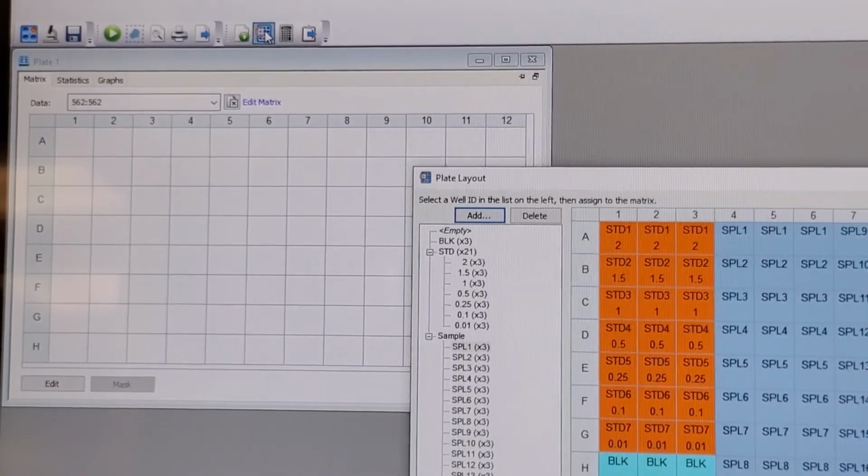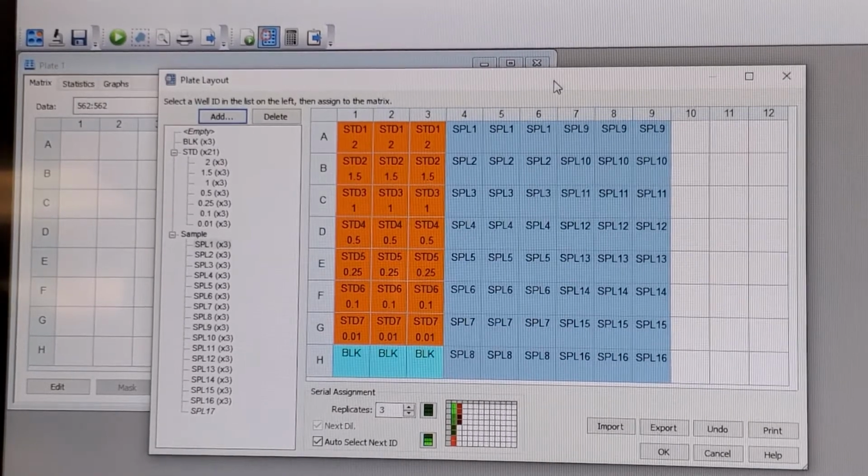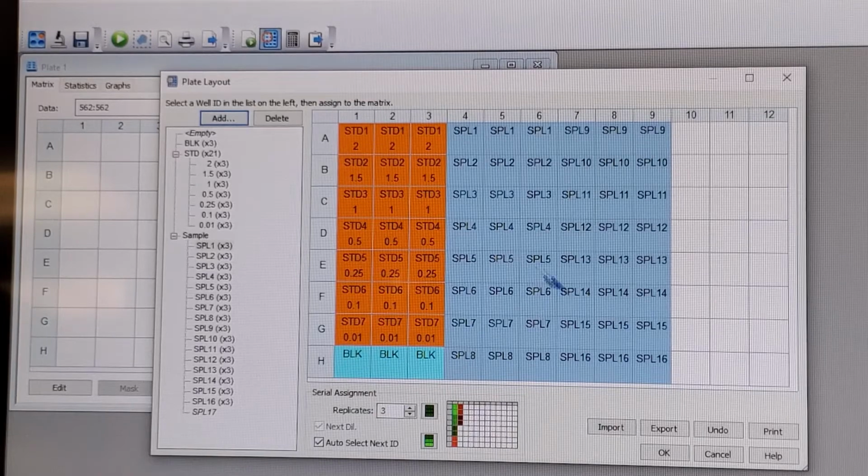Click on plate layout and you'll get this window up here with the blank and the different concentrations of my protein ladder and the samples that I'll be running. So once everything's ready, if it matches my samples, then read your plate. Make sure you do the setup based on however you set up and loaded your samples onto the 96-well plate. So in my case, this works for me.